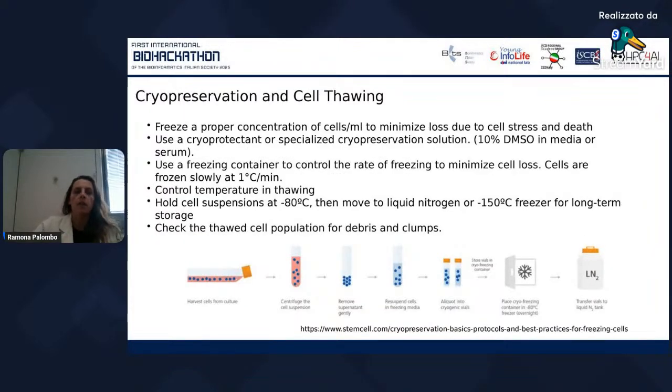fast on this. So after obtaining the cell suspension, I can choose also to freeze the cell suspension and then thaw it in the following procedure when I want to analyze the sample.